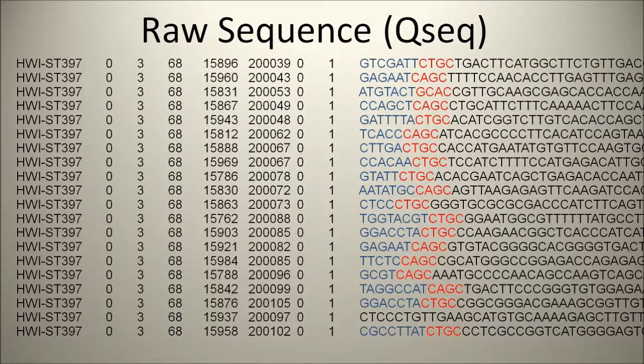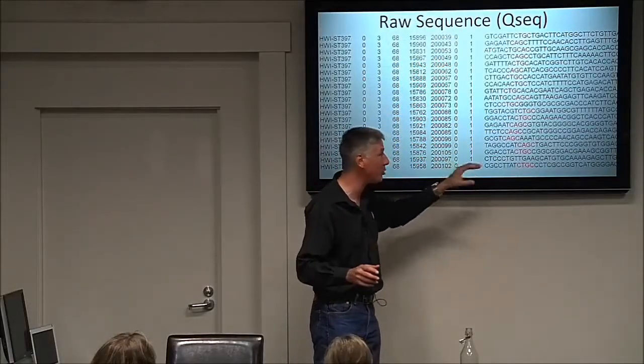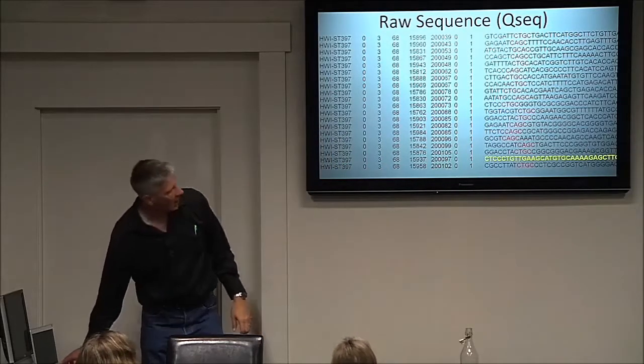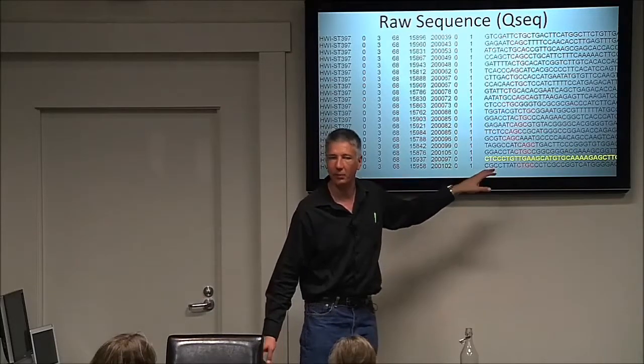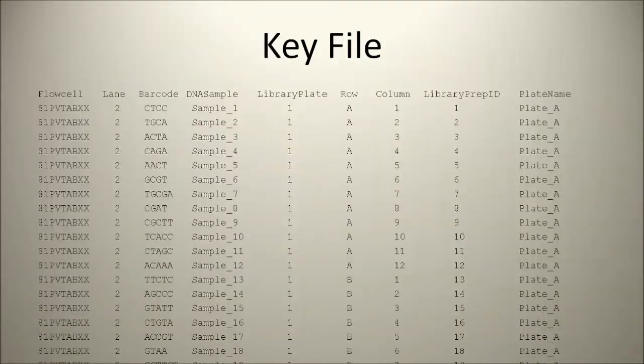And so you see in red, those are the restriction cut sites, right? Okay. And before those, there's some other letters. Those are the barcodes. So when you open up a sequence file and you look at it with its GBS data, not if it's just random sequence data, but if it's GBS data, you should see some patterns kind of like this. Now, not everything shows the right pattern, so we've got some things that don't come through quite perfectly. That's true with any system, so just to highlight that that happens.